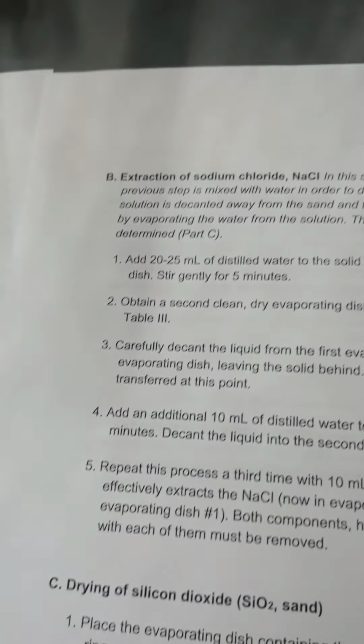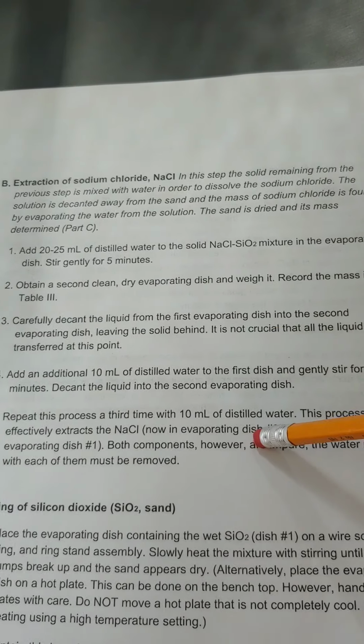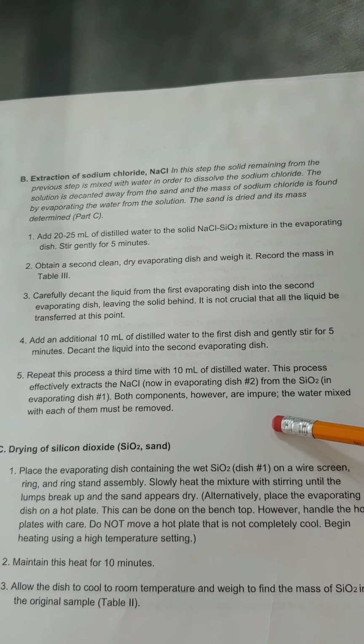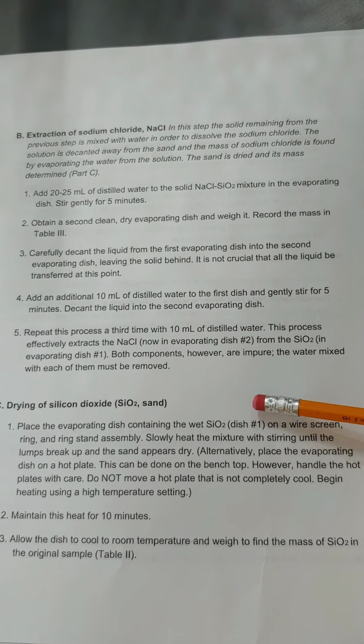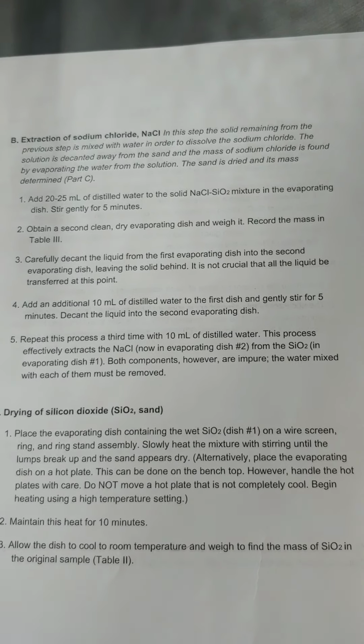So on the report on the laboratory, I'm going to be working through part B of the lab. And then when I get to the end of that section, I'll come back and explain that now I'm going to go through the process of drying the sand and drying the salt at the same time.